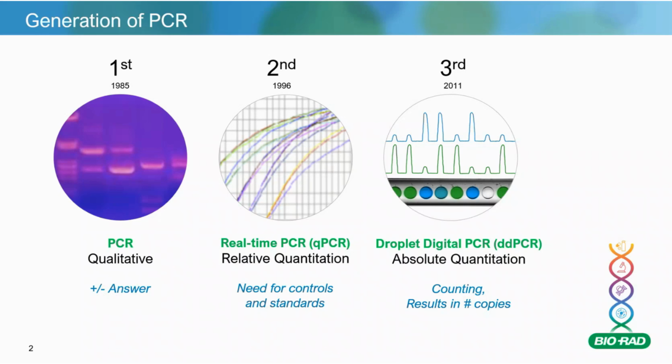And what you're here for today is to discuss the third technology, which is Droplet Digital PCR, an absolute quantification method. Like endpoint PCR, the detection point is at the end of the cycle. So it's read at the end of the cycle, unlike real-time PCR, where it's read in the exponential phase. But like real-time PCR, it makes use of fluorescence tags or molecules that are bound.